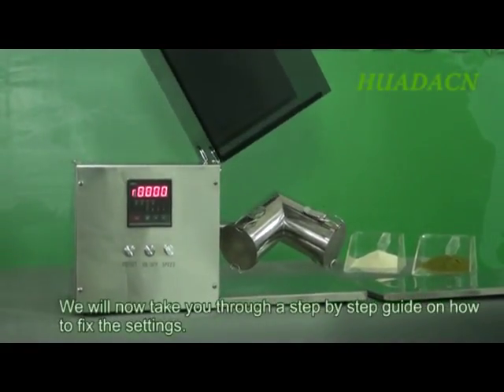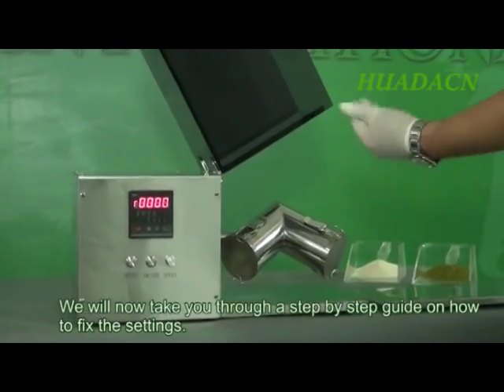We will now take you through a step-by-step guide on how to fix the settings.